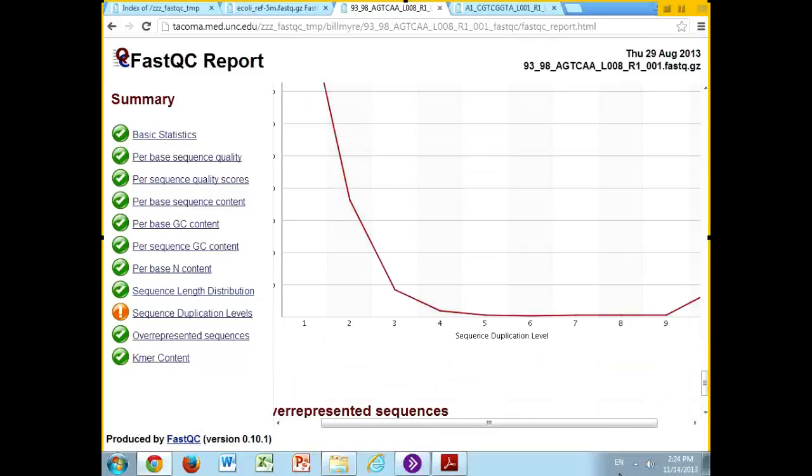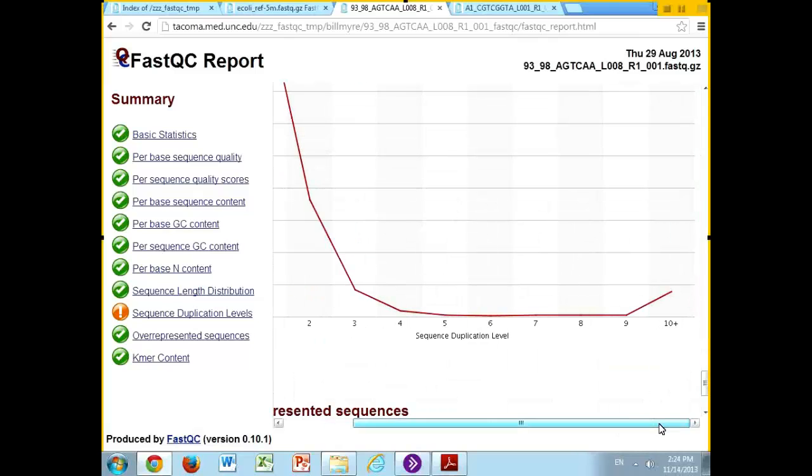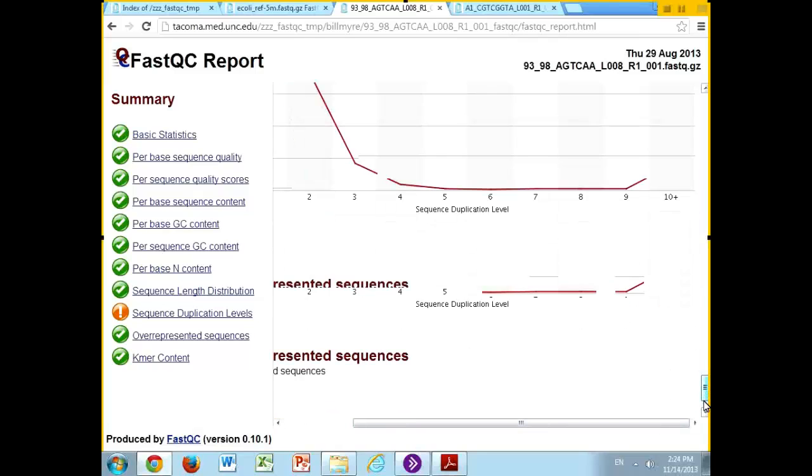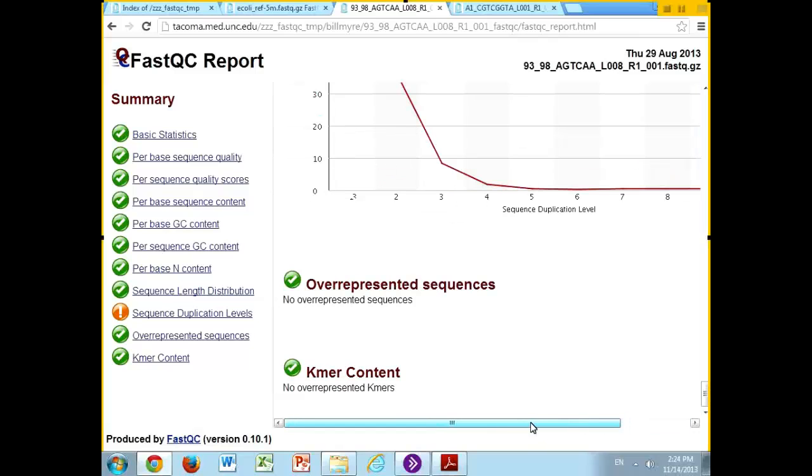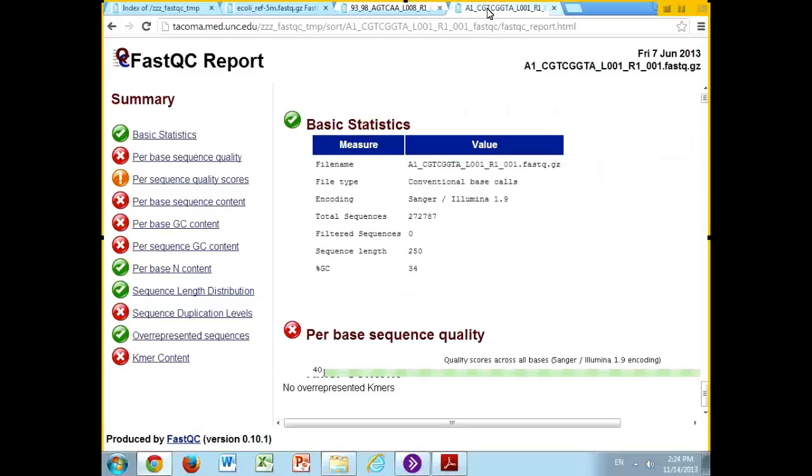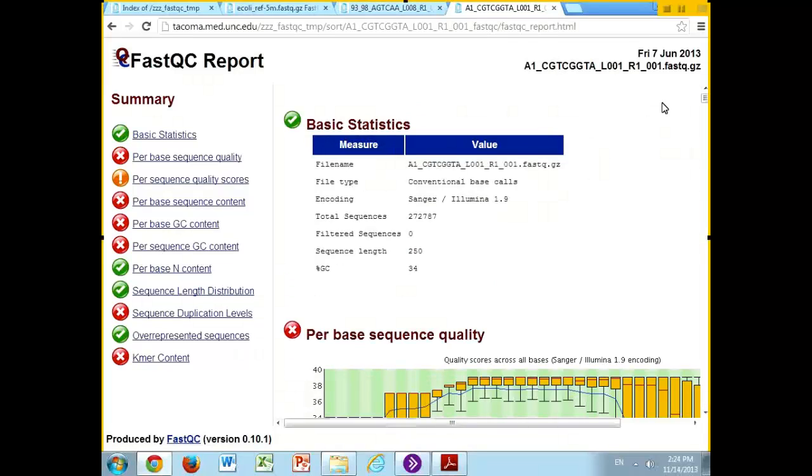N content is fine. Length is obvious. Here you can see in this case it did find a few samples that were repeated quite often.